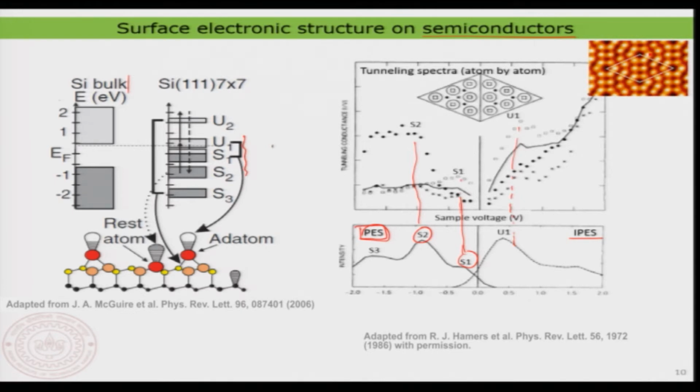So, therefore, you would find that tunneling spectroscopy is rather difficult to do, because one needs to do it atom by atom to understand. But just for a quick understanding of the electronic structure of a film, one would not immediately apply tunneling spectra; rather you quickly check with ultraviolet photoelectron spectroscopy, because this is much quicker and more easily accessible than tunneling spectroscopy, for example.